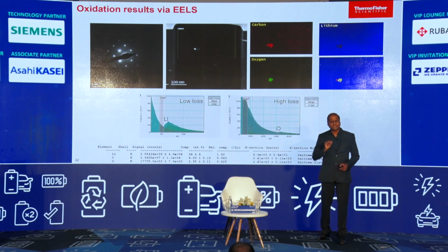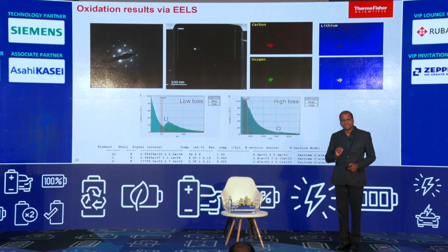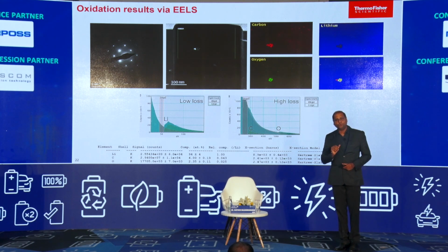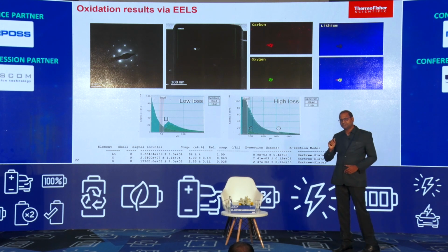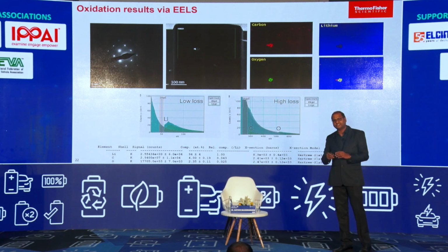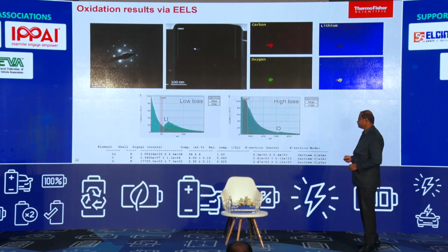So this very clearly proves that the lithium material that we want to analyze has been captured in its true native state. And the energy filtered image shown here very clearly shows the presence of lithium with very little oxidation over the sample surface.